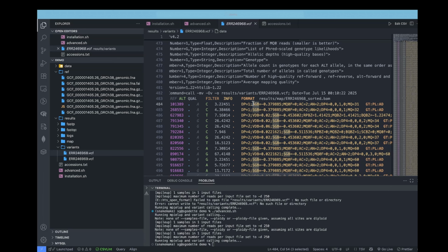You can clearly see it here. SGB simply stands for segregation-based score. It's a penalty that is applied when the variant looks too good due to perhaps things like under-segregation. It's much more specific to BCFtools. We have another annotation here called the MQ0F. What MQ0F basically means is the fraction of reads with a mapping quality of 0. A score of 0 basically tells you that 0 reads had a mapping quality of 0. That's a little bit more informative.